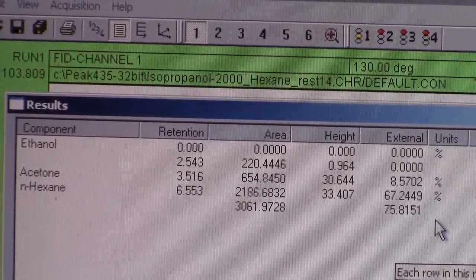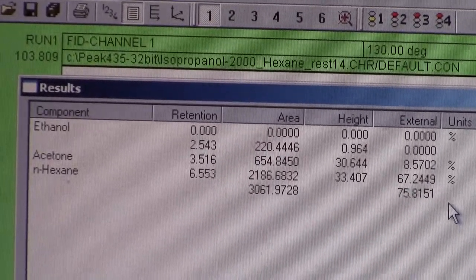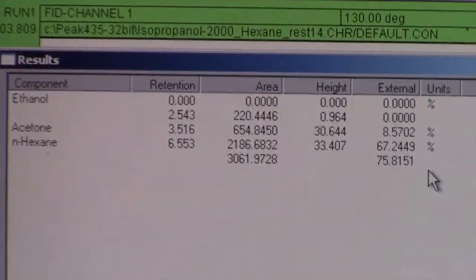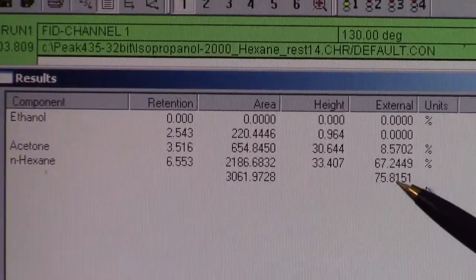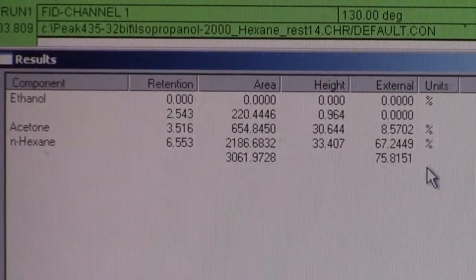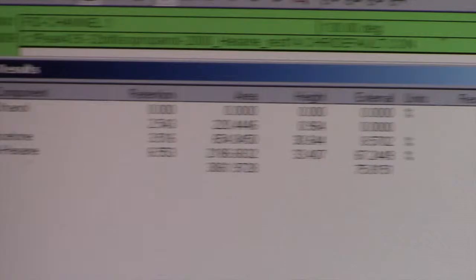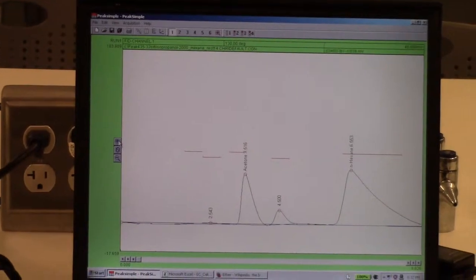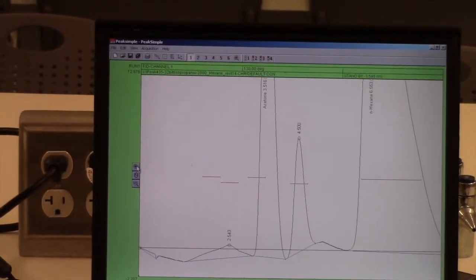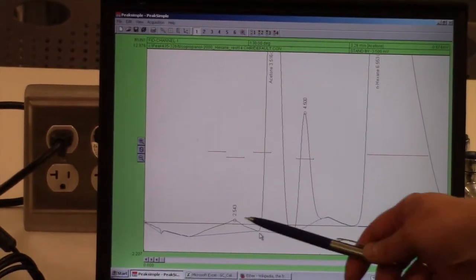So the rest we can presume would or should equal ether. However, those 25% should be divided into at least two other components, as you can see from two spikes.